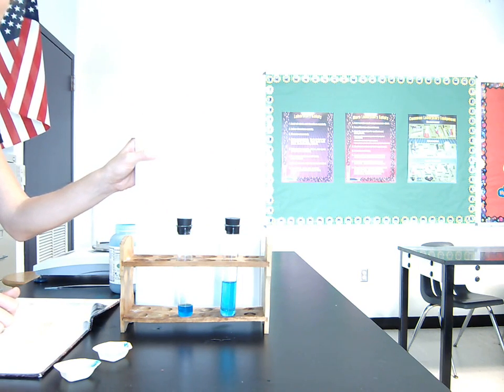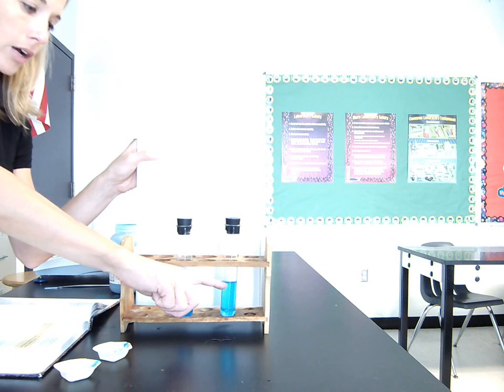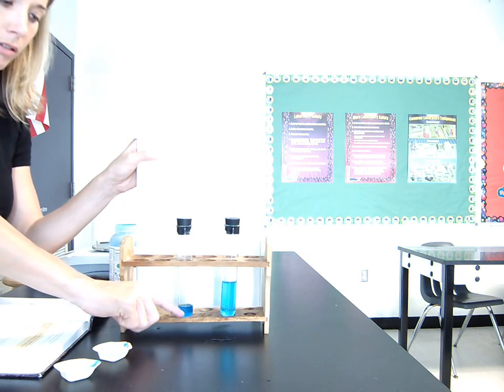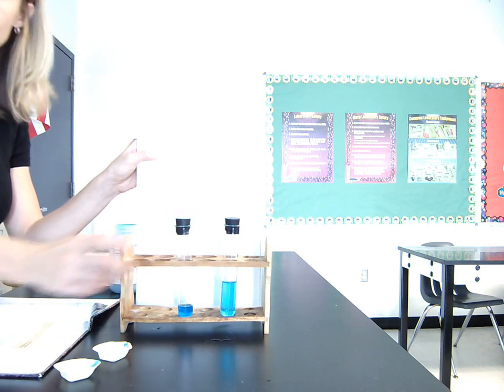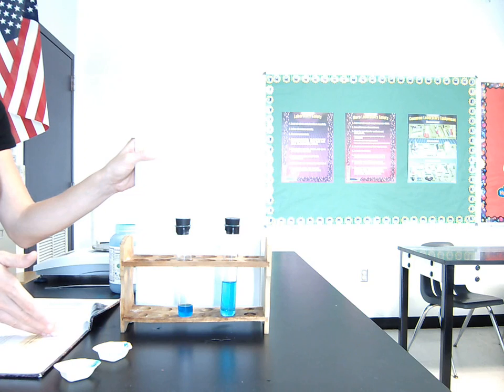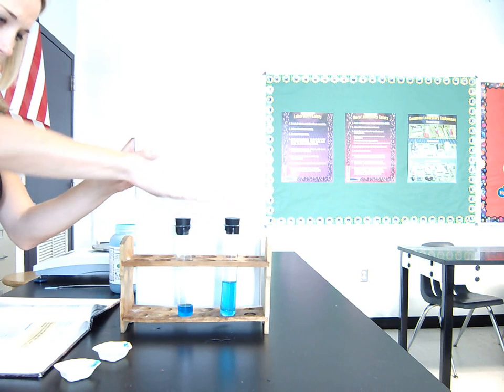The next Blue Dot says, is the color uniform throughout the solution? Yes, we spent a lot of time the first go around talking about uniformity, but yes, it's definitely uniform. You can see the color is the same all the way throughout when you're comparing it to itself, and the same thing here. The color is the same all the way throughout. What that means is it's uniform. Uniform means the same throughout. Okay, so yes, the colors are uniform in each test tube.